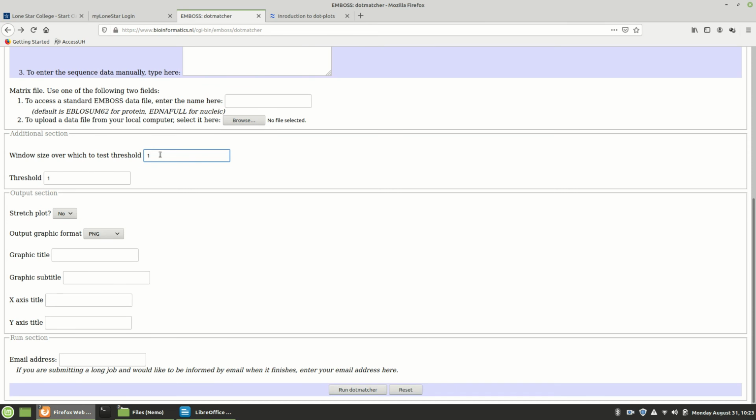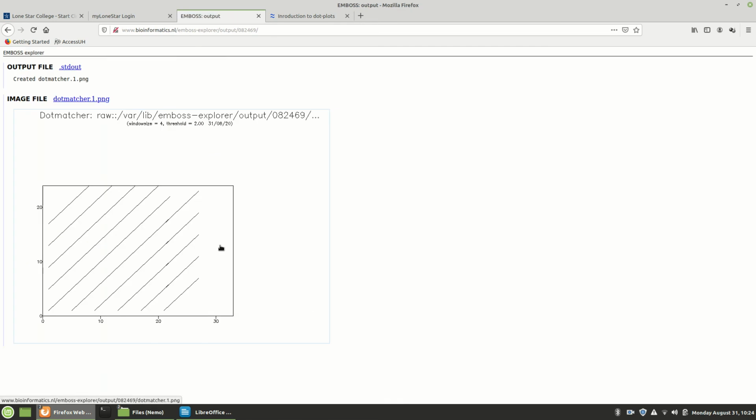So let's say we're doing 4 at a time, and we want 2 out of 4. That's 50%. That's pretty high. That's going to make it easy to make it. Everything should run together when you have something like that. Yep, you do get some blanks over here because we put in some sequences that didn't match even out of 4 out of 4. So this makes sense. All right, now what you're likely to get is a straight line with just tiny little slivers out here. So put it in, and let's see what you get.